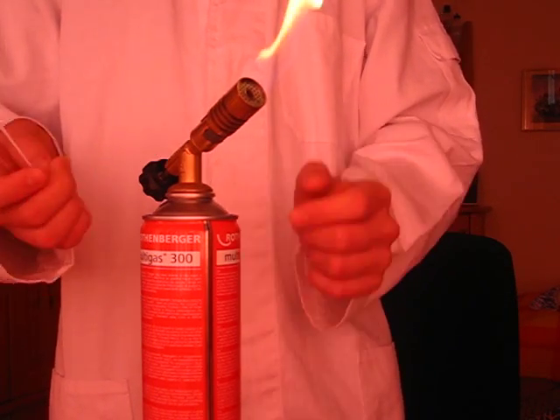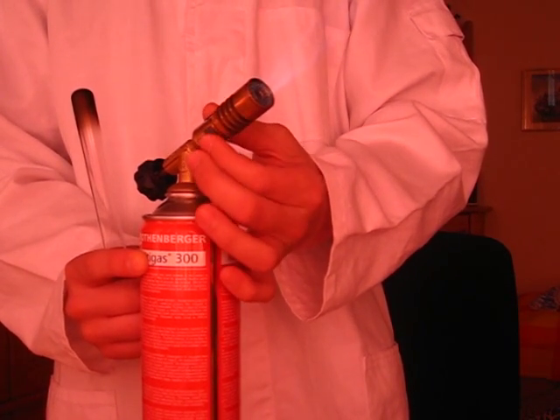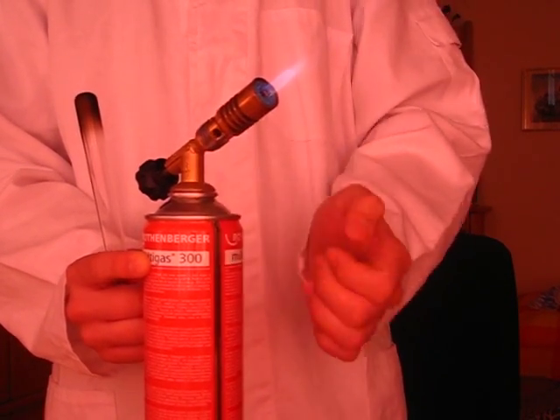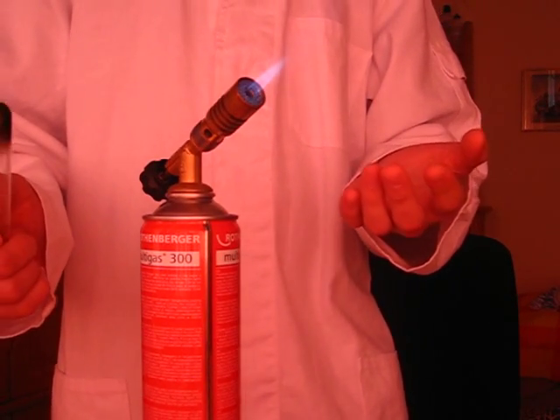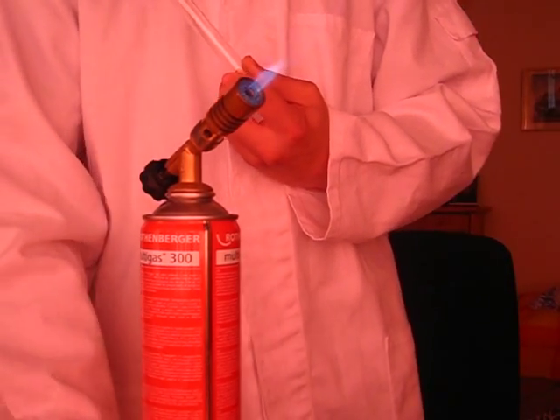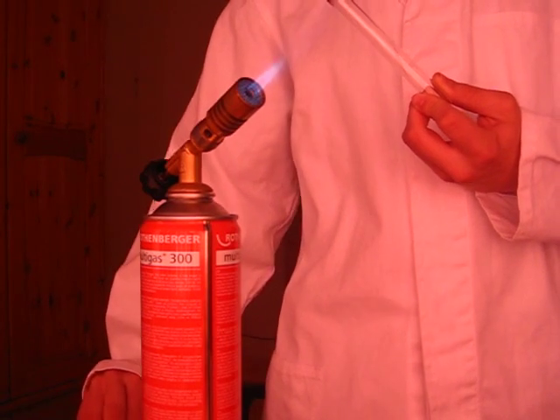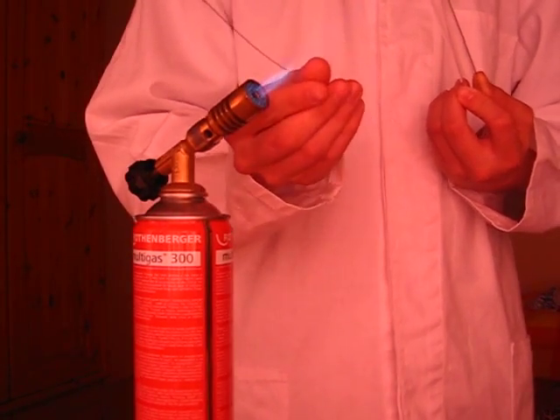So if we want to use the Bunsen to sterilize equipment, we turn the metal back and get this much hotter, blue, invisible flame. Now this flame has two types of zones. The first zone is this zone. This is the zone which is not hot enough.